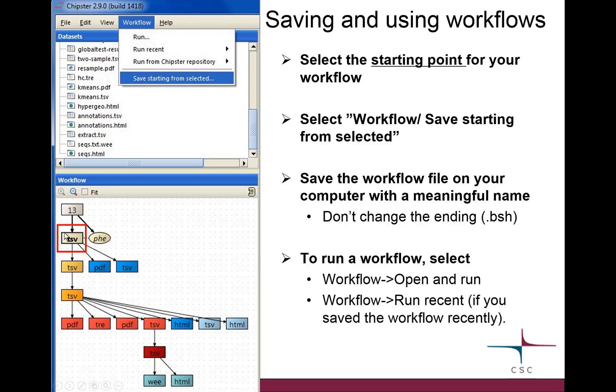In my case it's this file up here. The common mistake is that people select all the files, all the steps they want to include. But no, it's only the beginning, and then it's able to figure out from there what you have done after that point. Of course, the workflow can start from anywhere. We started it today from the FASTQ file, but it could equally well start from something, a later step.